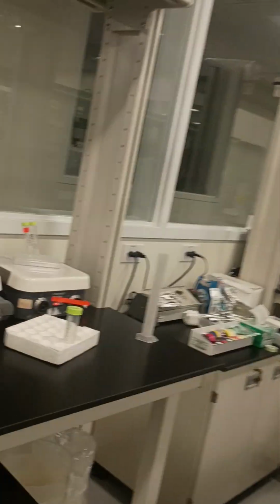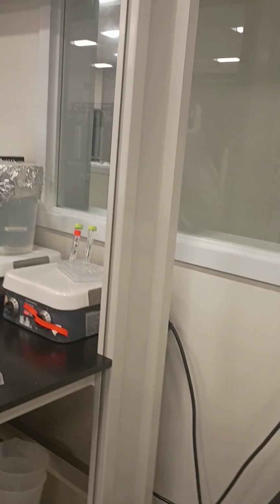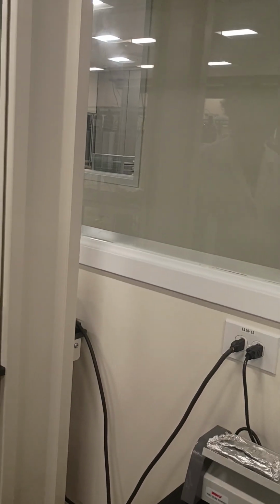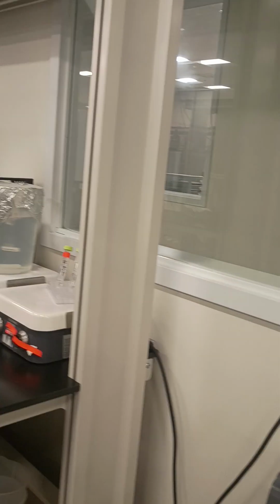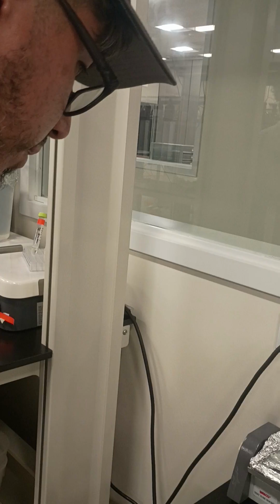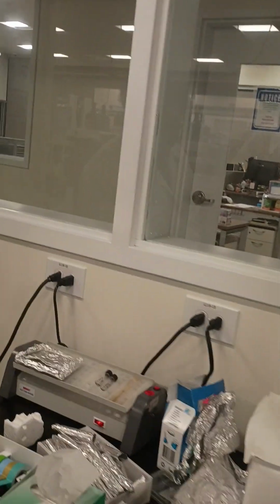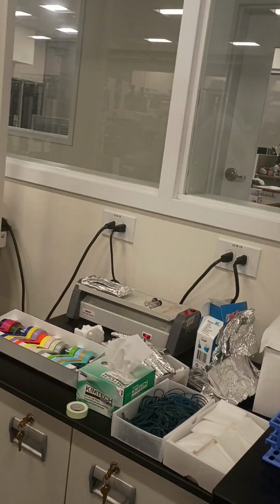Like for example here, this is a stir plate. Somebody's running something, so just leave it like that. Don't bother it. Here's a shaker. Changbo is probably running something. Don't touch it. But if there's nothing on it and it's just shaking on its own, then you can turn it off. If there's a sample on it, that means somebody's running a reaction, so don't touch it. Here's the button right there to turn it on and off. Pretty basic.